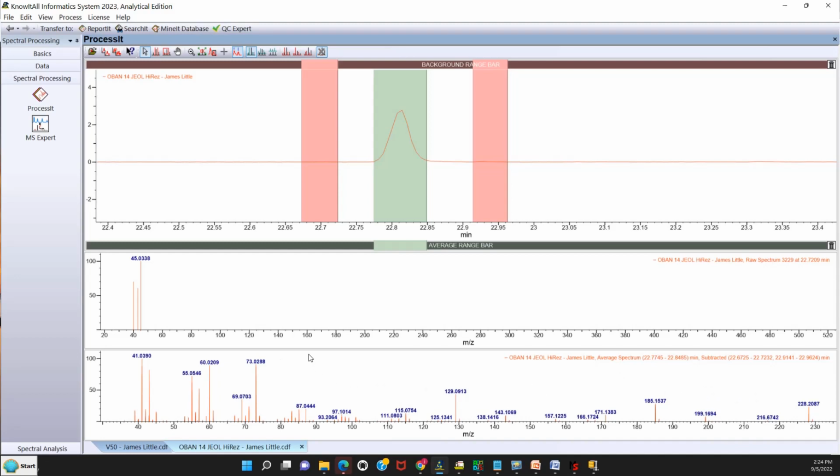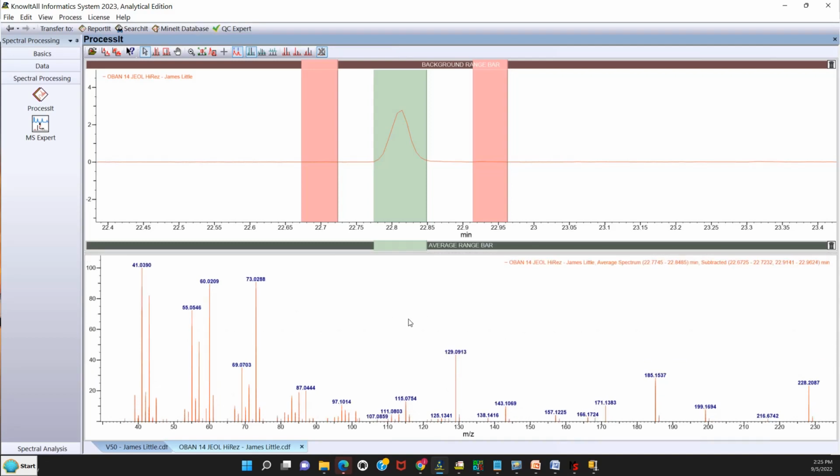And again, in this window, if you find you don't want this dynamic window where it changes as you go across the peak, just go and push up on the bars there. Again, the mouse pointer changes shape, and I can make it go away. Just gives me more space to work. And at this point, you're ready to send this to the search.